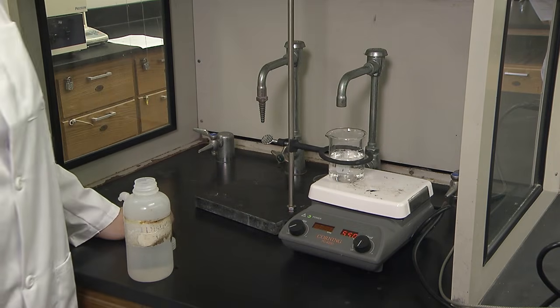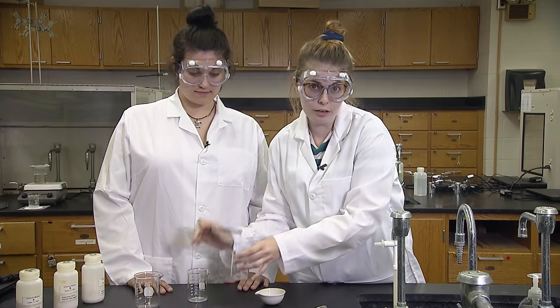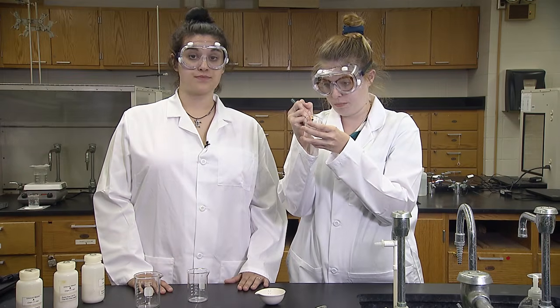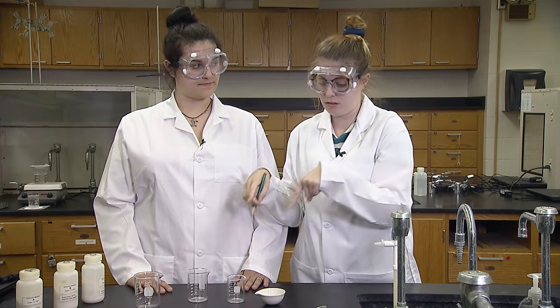The 150 milliliter beaker is labeled 1. The 100 milliliter beaker is labeled 2 and your initials. Do we mark the evaporating dish? No, but we need to measure the mass of each of these empty containers. If you need more information, see the How to Use the Digital Balance video.